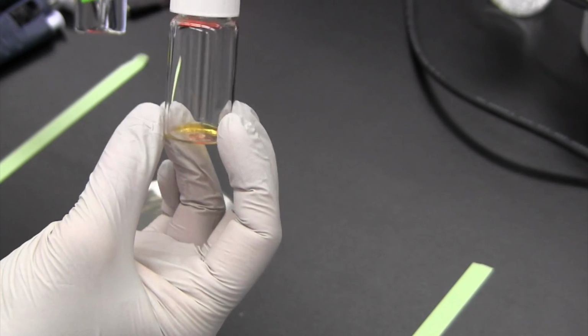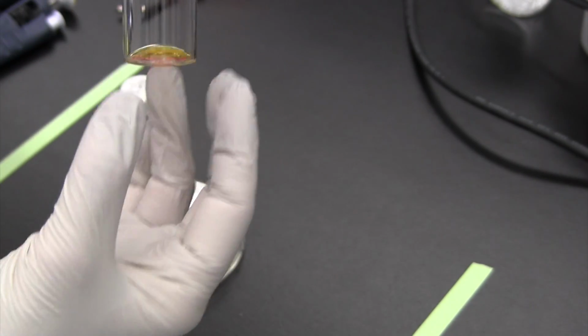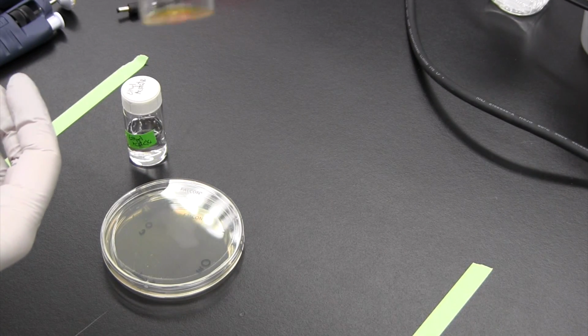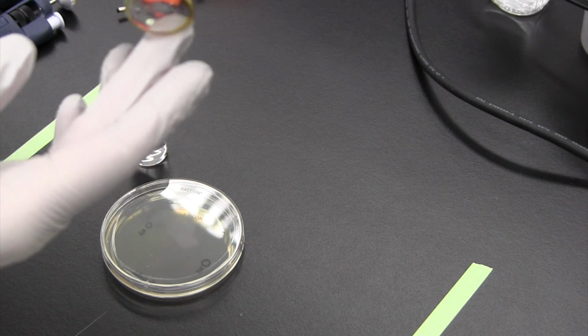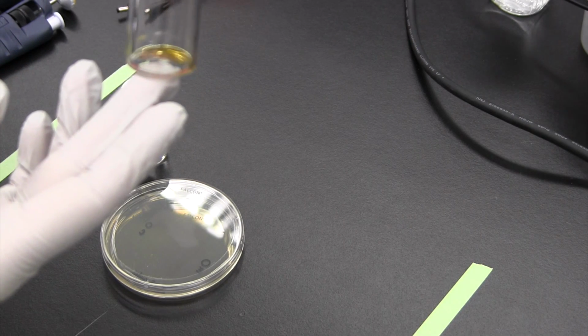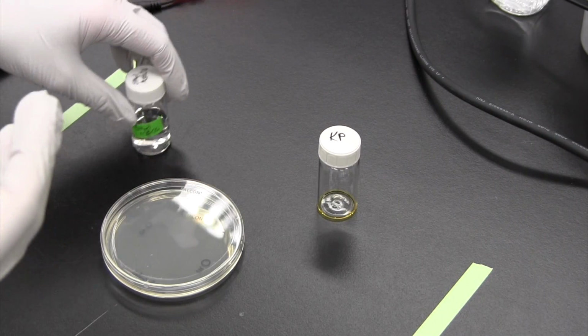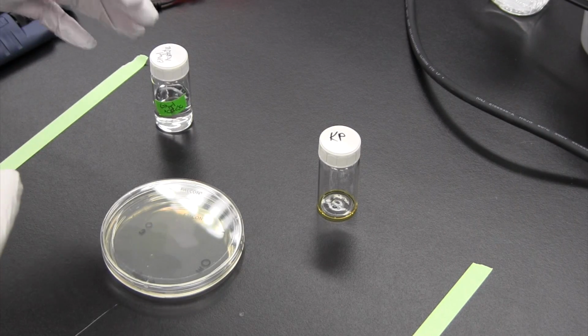So it's already been added to this container, and you can see it's a really small volume. But you can also see that it's a bright yellow color, so there's obviously something in there that's been nicely resuspended. This is now our concentrated chemical extract that we are going to use to test against an agar overlay of a tester strain of choice.